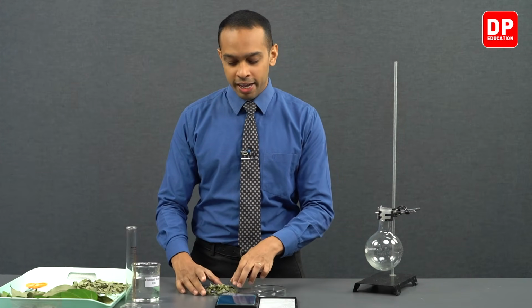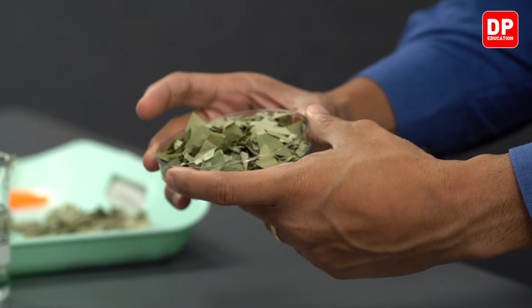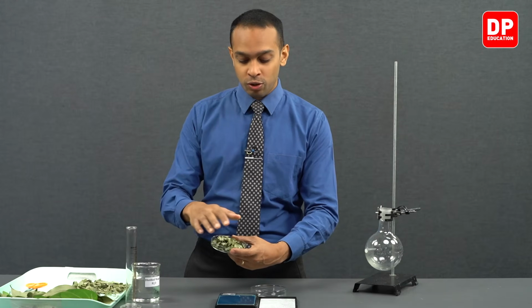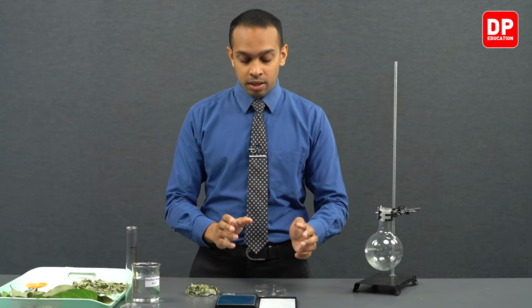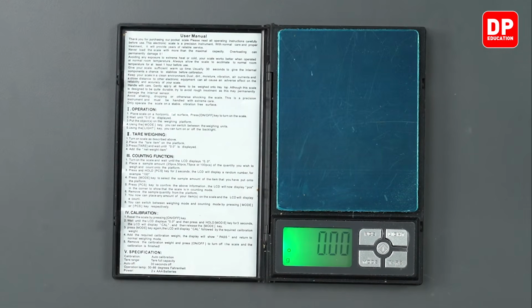Students, now we have cut pieces of cinnamon leaves here. We have cut a few cinnamon leaves and all the cut pieces are now present in this petri dish, and we are going to weigh the cinnamon leaves that we have here with the use of a digital balance. So we will turn on the digital balance and it reads 0 now.